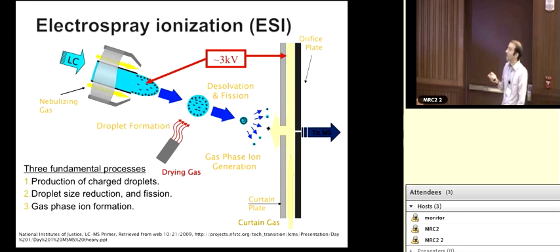Okay, so let's talk about how you would make an ion, and this is relevant because it affects the signal that you get out of a mass spectrum. It affects what sort of metabolites we can see, and it affects those matrix effects that I'm telling you about. And matrix effects, I should probably define that term for you, is anything that interferes with quantitation of your molecule of interest that is derived from something else that's present in your sample.